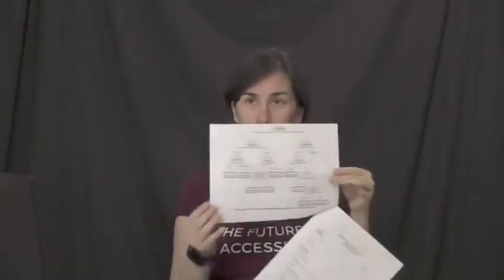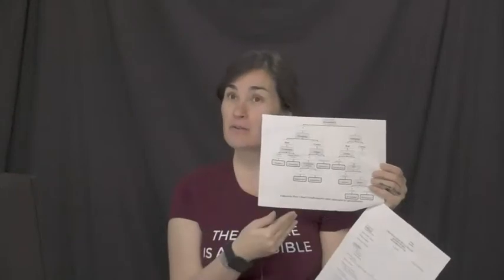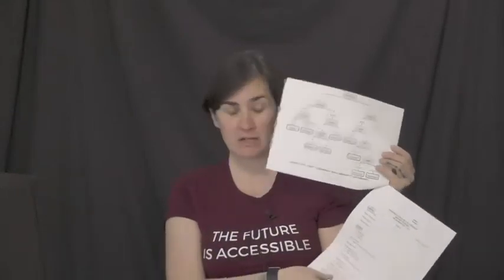So on Wednesday, the 10th, you're going to get a packet. It'll look a lot like this. On the front of the packet, it gives you some instructions. We're going to go over a lot of that today in this lecture. Then there is a flow chart. This is what you'll use to identify your bacteria.